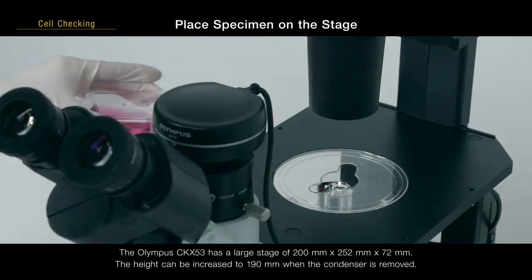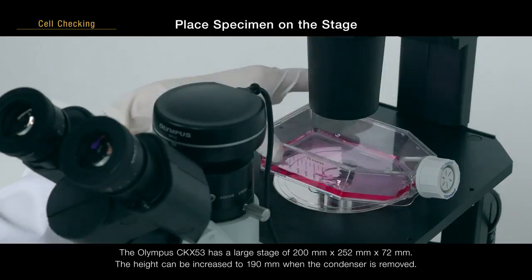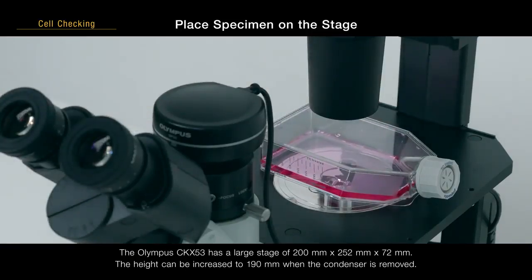The Olympus CKX-53 has a large stage of 200 mm by 252 mm by 72 mm. The height can be increased to 190 mm when the condenser is removed.